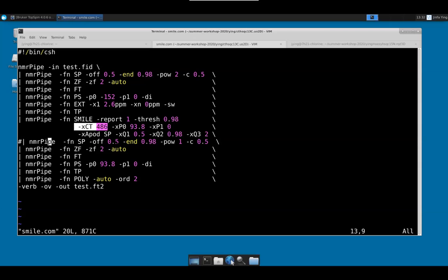But Frank shows this with IST also. He shows that you can improve the resolution. Yes, certainly. Any NUS, yeah. So I think that people realize that nowadays it's better to use NUS to do linear prediction, okay? And I think Jeff did that first. Yeah. All right, okay. So another question, someone else was asking questions.